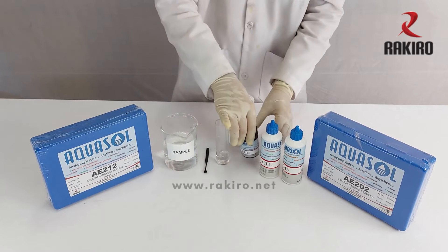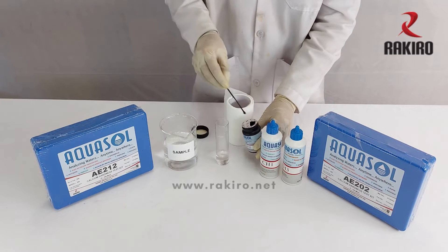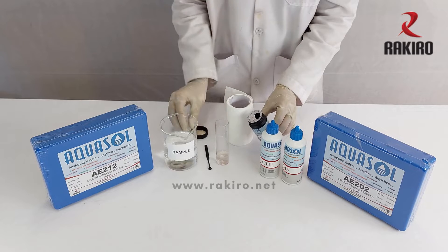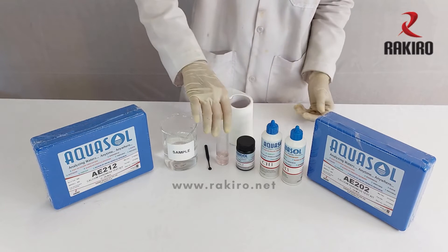Now add 1 spoonful of reagent CH2. Mix well to dissolve, then close the cap tightly.